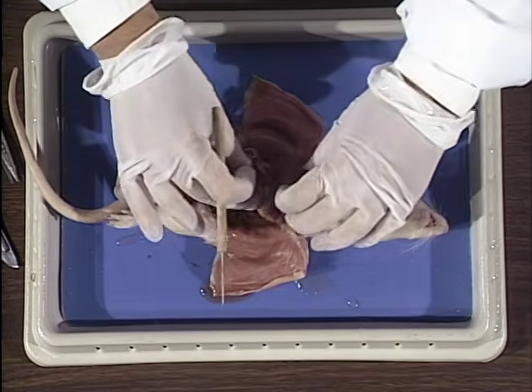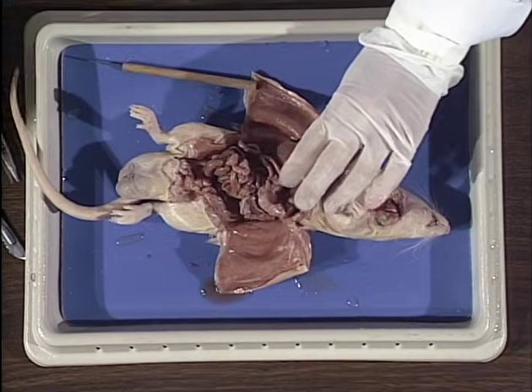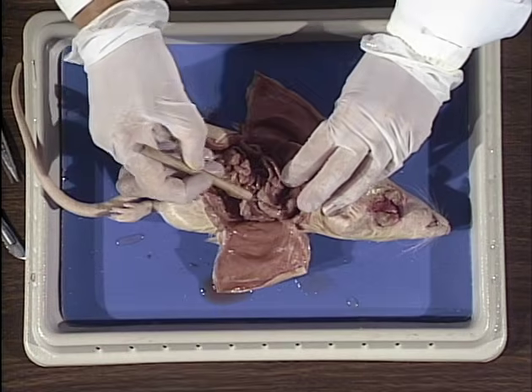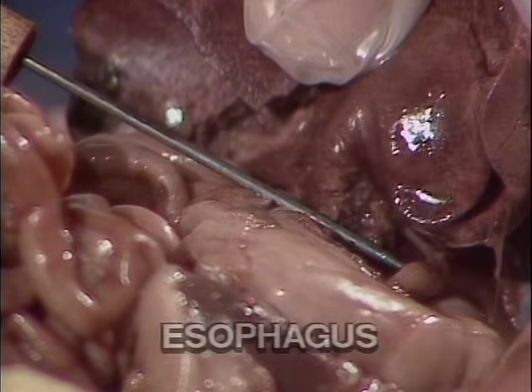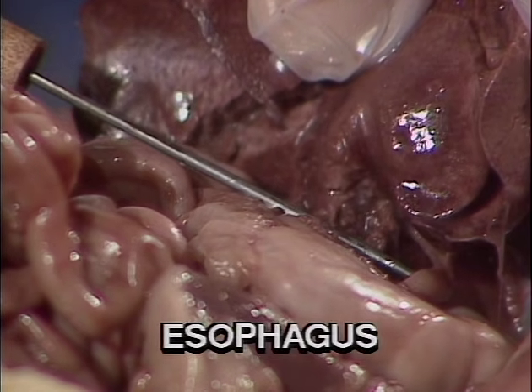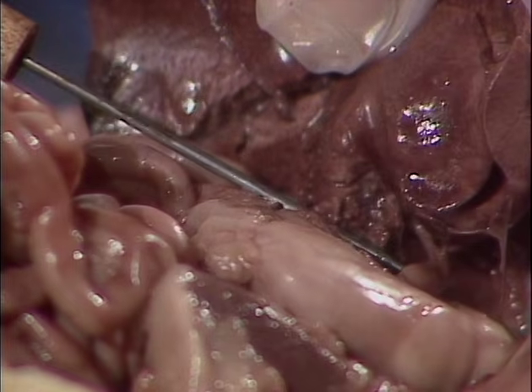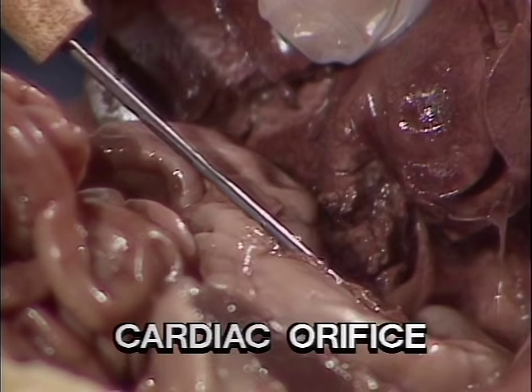We will begin with the digestive system. The digestive system begins with the esophagus, which is this tube that connects the stomach to the throat cavity. The esophagus joins the stomach at the cardiac orifice.